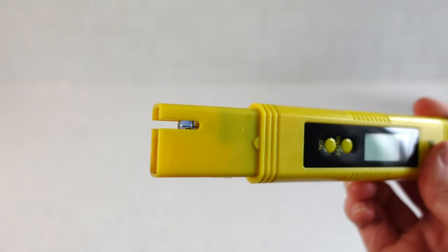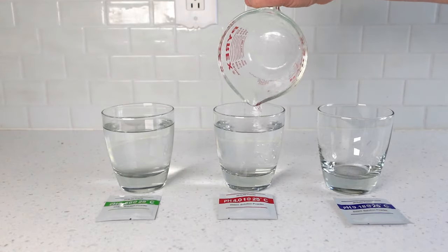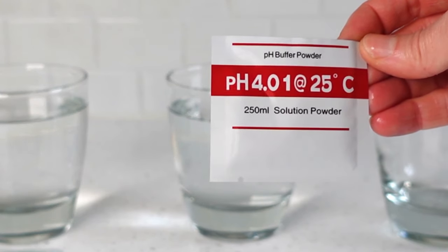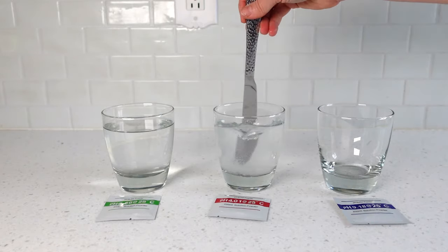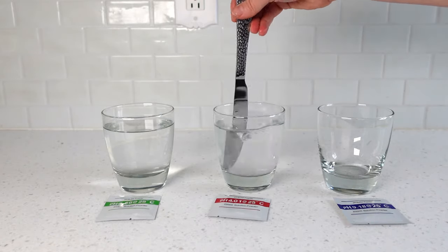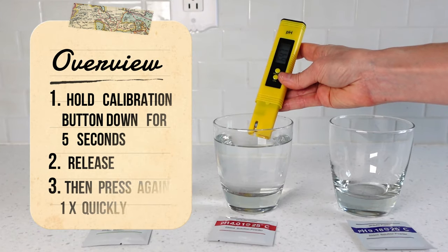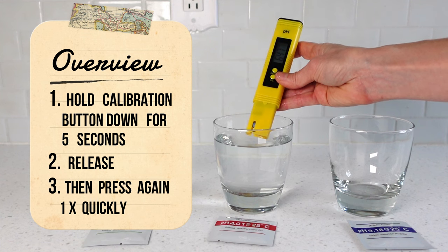Now we'll do the second calibration. Bring another 250 milliliters of water up to temperature. Open the 4.01 packet and empty the contents into the jar. Stir until completely dissolved. You're going to hold the calibration button down for five seconds, release, and then press it one time quickly.